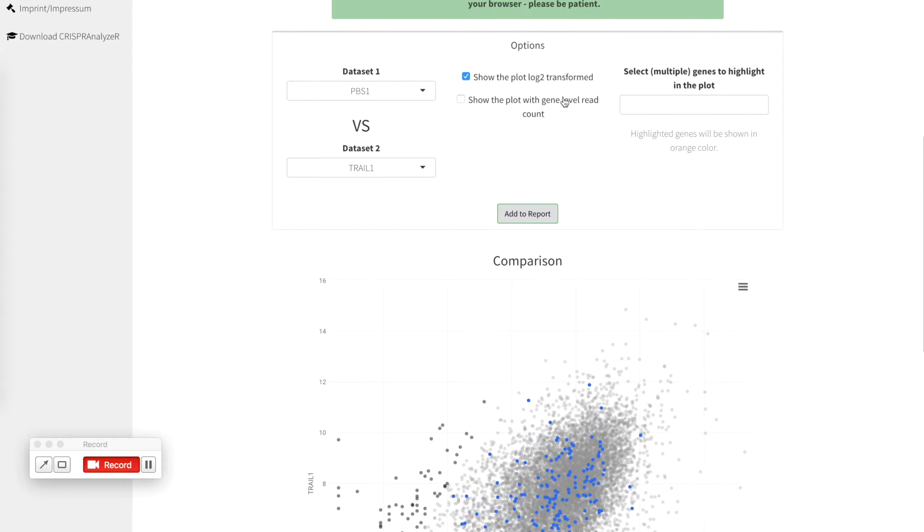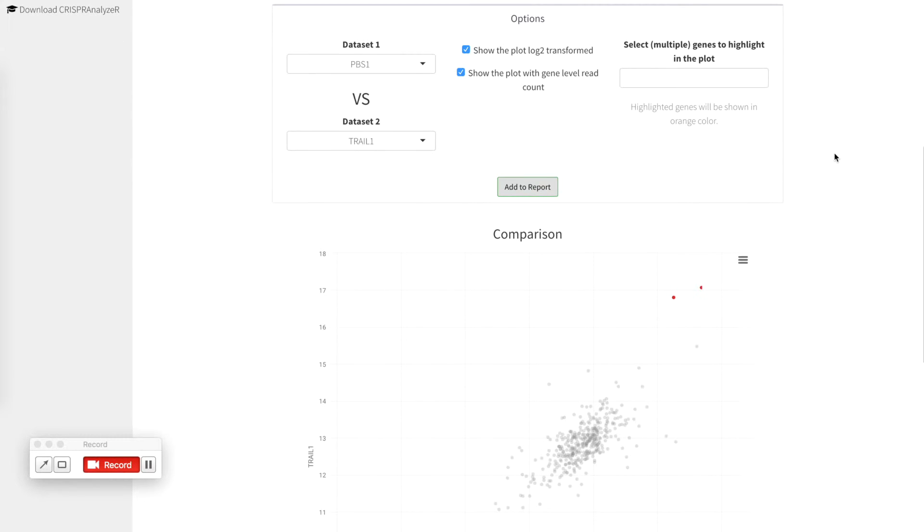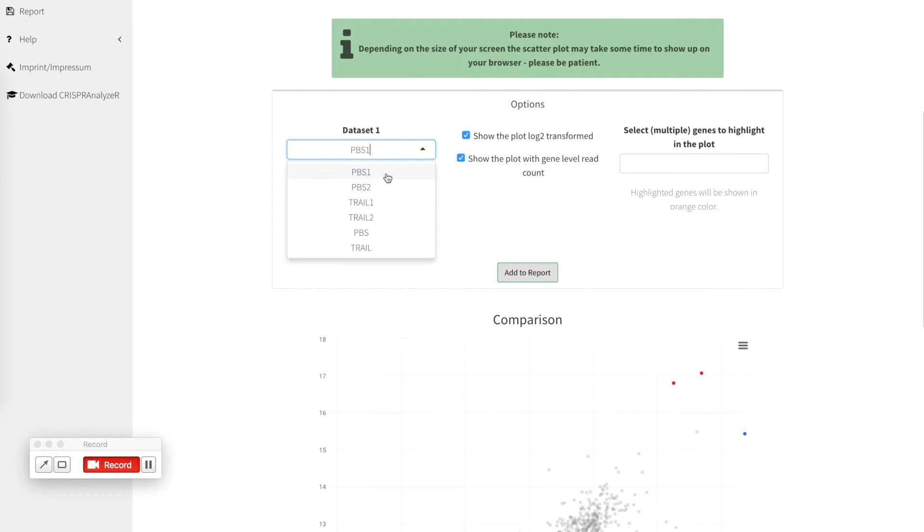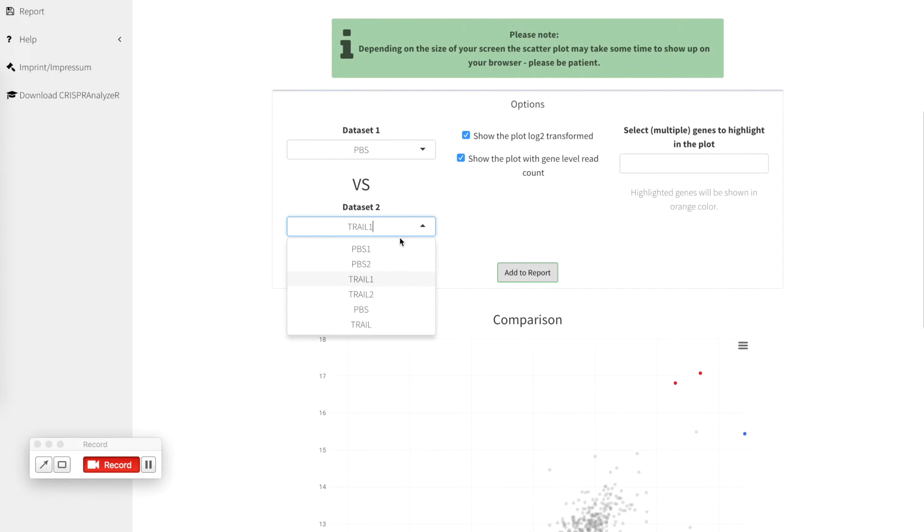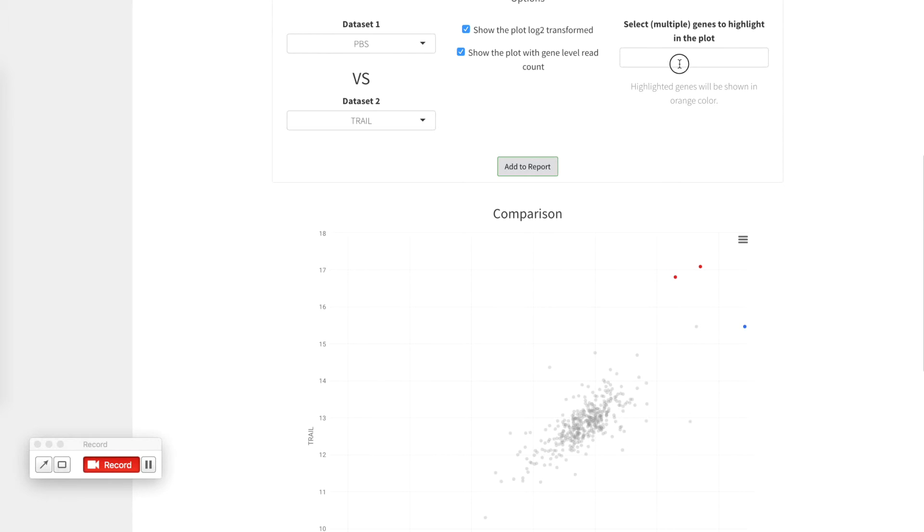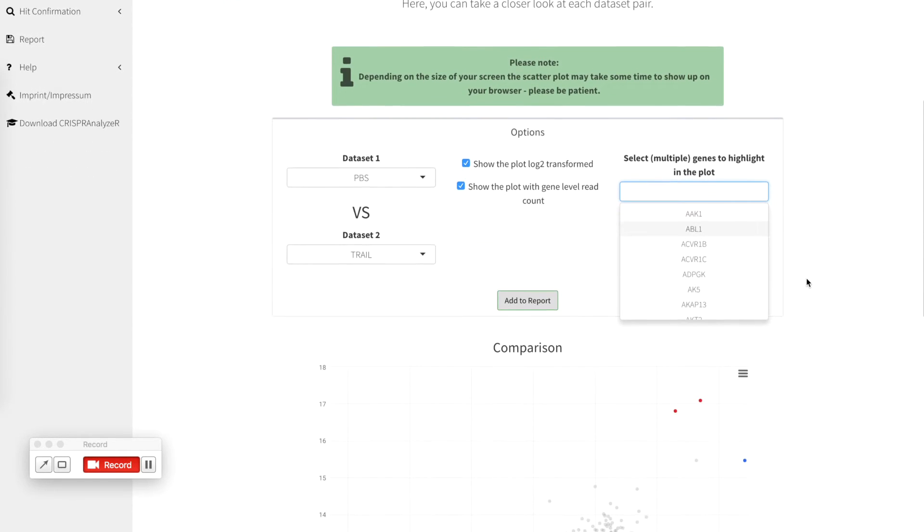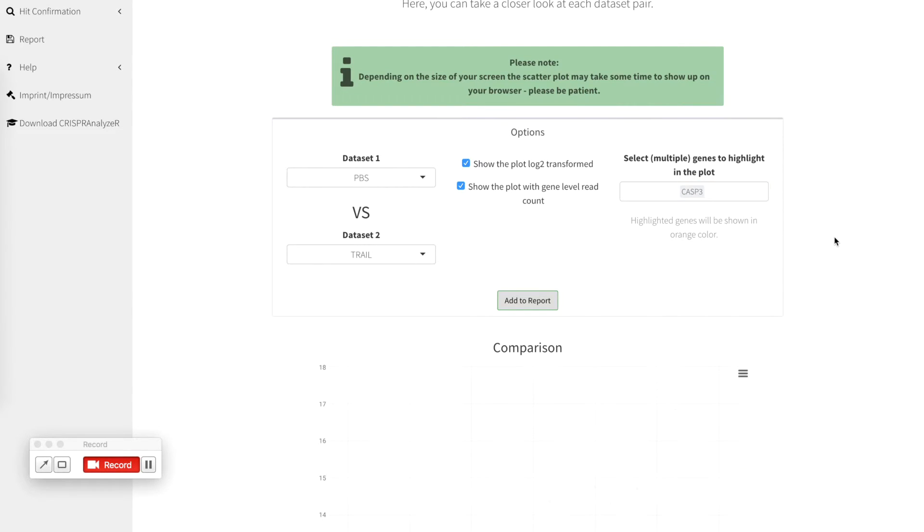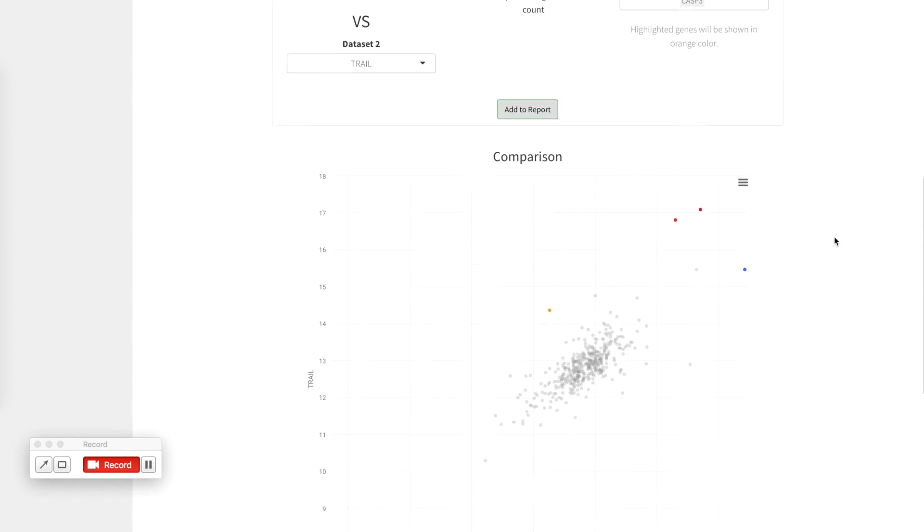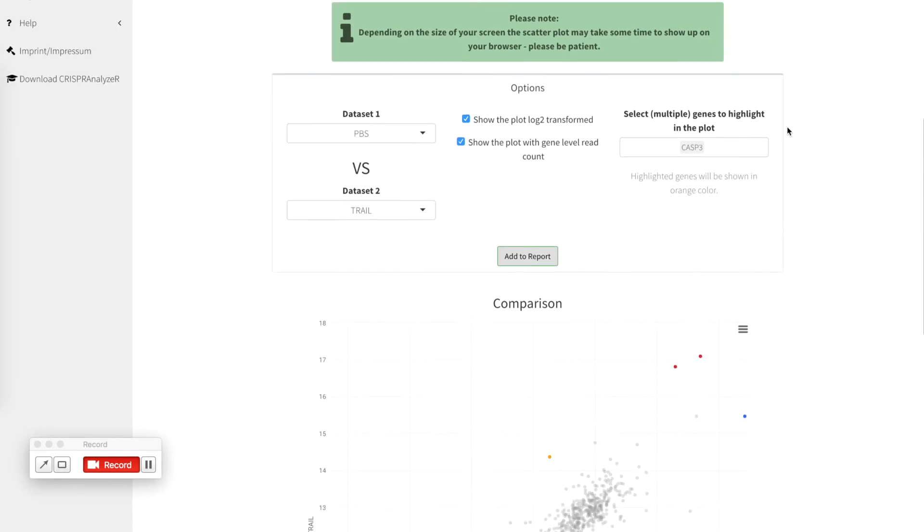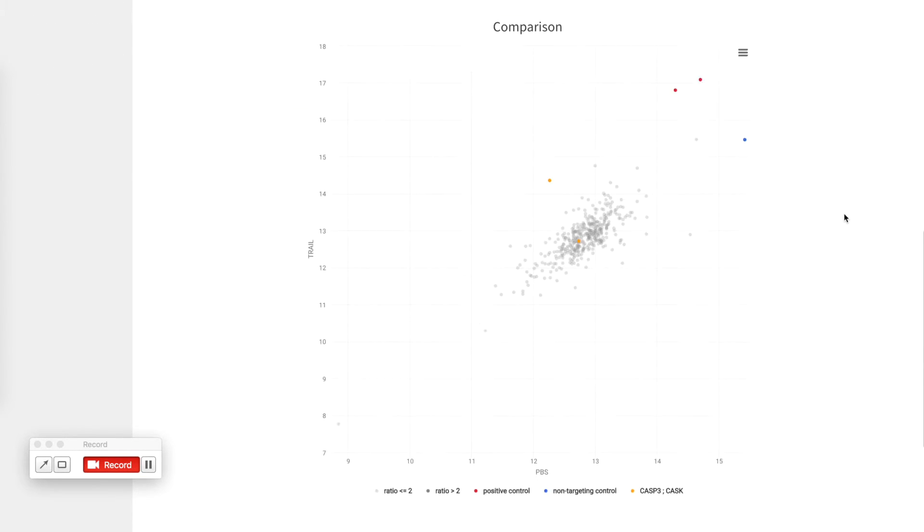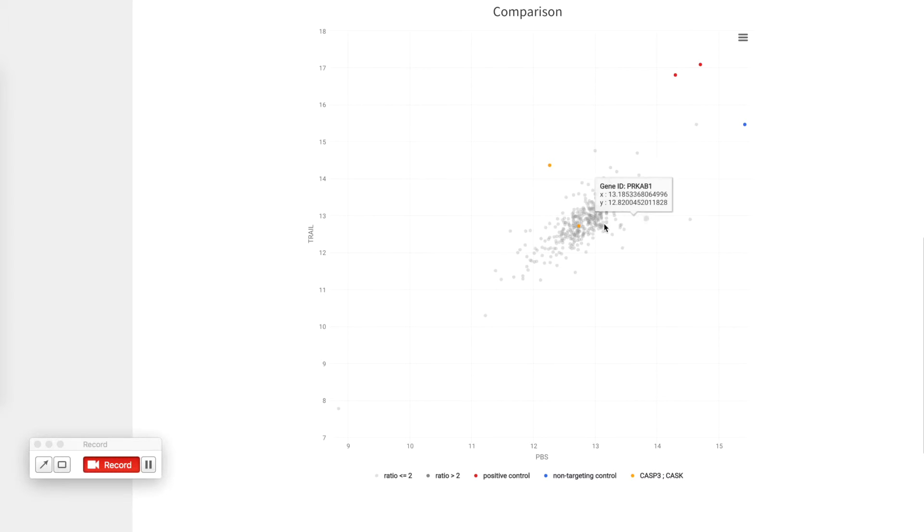We can go back on for example for the gene level read count and also plot the two mean replicates against each other. If you want to know a bit more about certain genes that are included you can select multiple genes here to highlight. This is a so called fuzzy search so you can just start typing and the CRISPR analyzer will tell you which genes are included. Let's have a look at caspase3. Caspase3 is highlighted in orange color. If you include more genes like cask, it will also show in orange color.